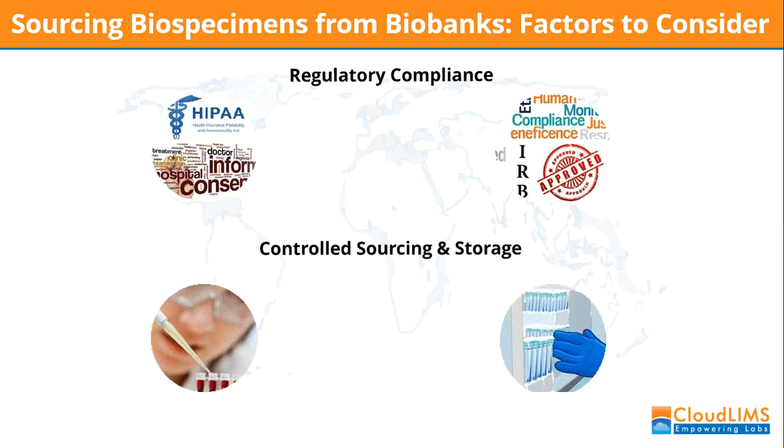And we need to make sure that these samples have been stored properly and the environmental conditions of the biospecimens has been maintained throughout the life cycle. So ideally we need a system that can record this information and ensure that any experimental data derived from these samples is reliable and can be published in journals without question as to the appropriateness of the sample storage.